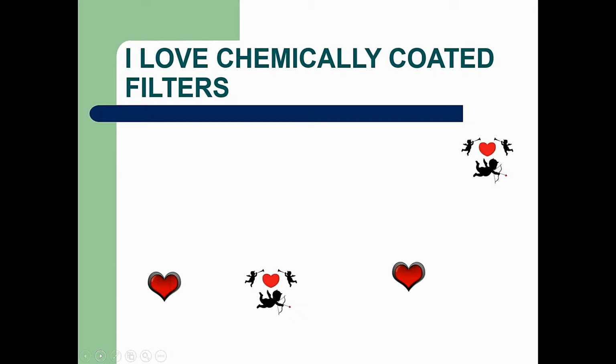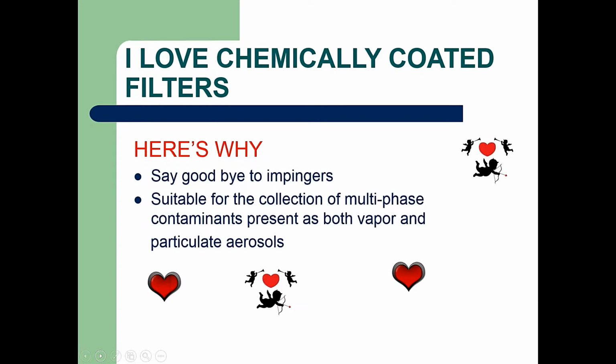Over the last several years, U.S. OSHA has been publishing a number of new methods using chemically coated filters. And honestly, if you can love a sample media, I love chemically coated filters. And here's why. You can say goodbye to impingers. They are a welcome alternative. They are also suitable for the collection of many multi-phase compounds.